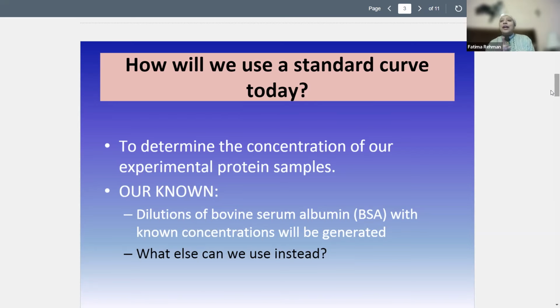Oh, so you know what you're doing right now? You are confusing two different things. You're confusing FBS, the serum that we use in cell culture to help the cells grow, because for those, eggs were used in the past as well. Egg yolks for those to provide those same growth serums. But that's not what we're talking about. We're talking about creating a standard curve for a protein quantitation assay.